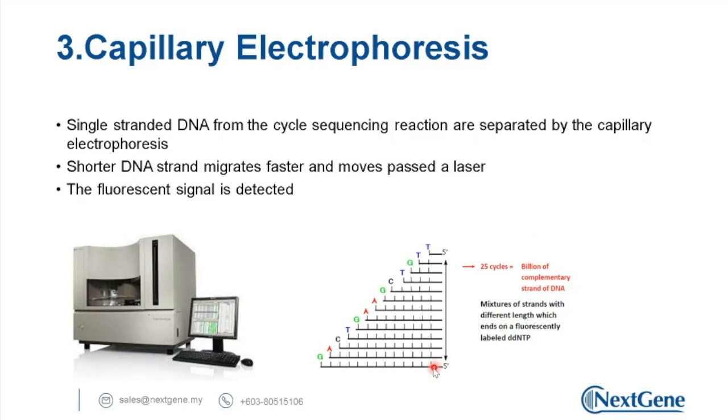Okay. Please ignore everything on top. Let's say this is the single-stranded template. You can see that it is 5' to 3'. Therefore, a sequencing event can only happen for the primer that is moving from 5' to 3'. The other primer that starts from, let's say, this direction has nothing to bind.